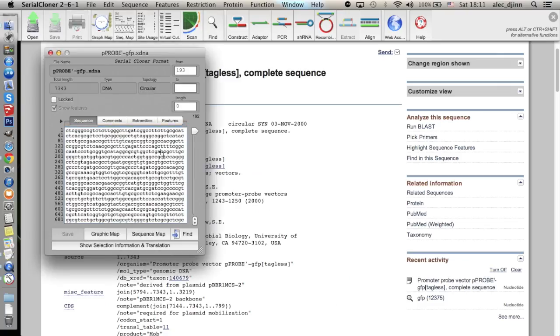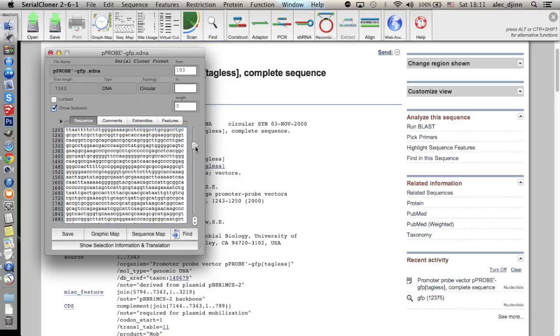Now comes one of Serial Cloner's best features. In the Functions panel, once you click the Scan button, the software checks the whole sequence and detects any part it recognizes. Scrolling through the sequence, you can see how some parts are colored. If you click on a colored region, you can quickly see the name of that specific sequence — for example, here we spotted a Lac-Z-alpha peptide, and immediately after that, a T7 promoter. This large green sequence here is the one that codes for chloramphenicol resistance, which is what CMR indicates.